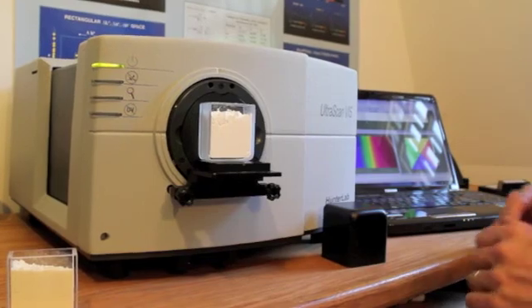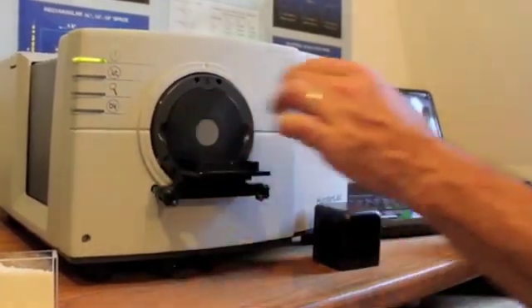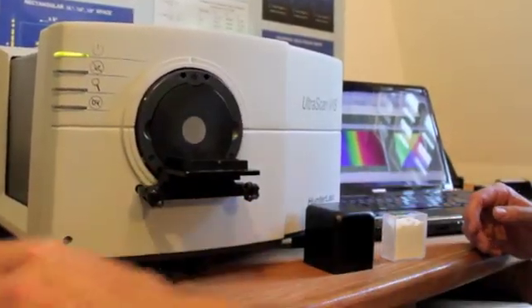And now we'll compare our new bright sample against an older product that's been on the shelf for quite a while.